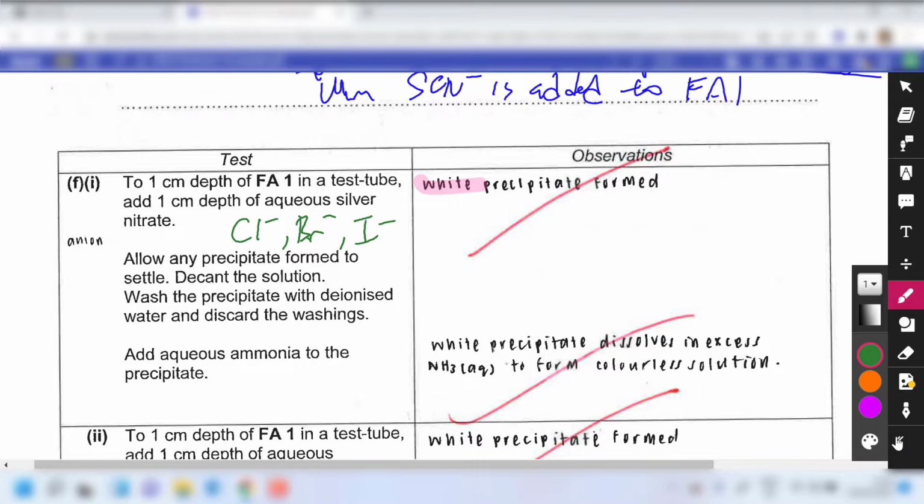But of course, in this particular experiment, there is a layer of complexity being added, because you do know that Fa1 also contains 2 cations, Fe3+, which we identified earlier on, and what's the other one? Let me try to recall. Copper 2+. Okay, so you have these two.